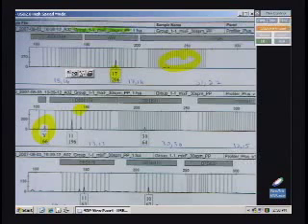This is just kind of regurgitated out through the software. I got the 30. So you didn't get any of the FGA. You did get a Y. Did get the 30, nothing here in D18.